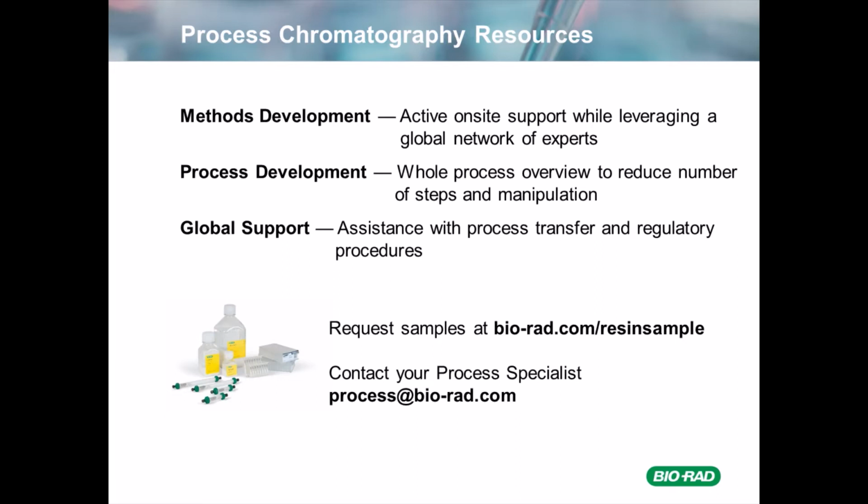So the last question for now is, I'm interested in learning about design of experiments. Does Bio-Rad provide technical training on design of experiments for mixed mode resins? Oh, yes. We can set up a Zoom meeting or a webinar to go over the DOE design with you. For example, we can help you select the parameters and their ranges according to your purification needs, so as to understand the interaction between a target molecule and the resin.